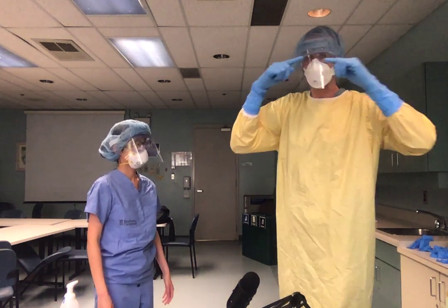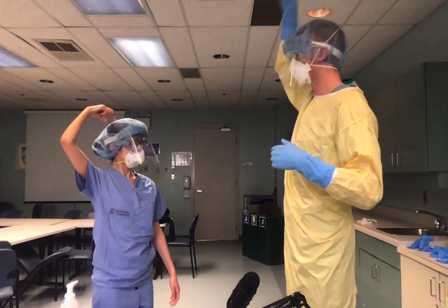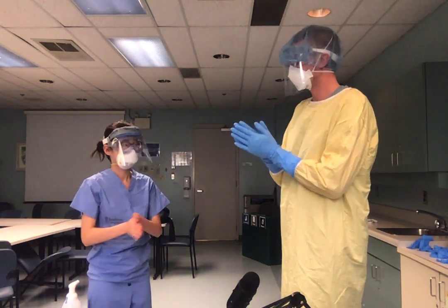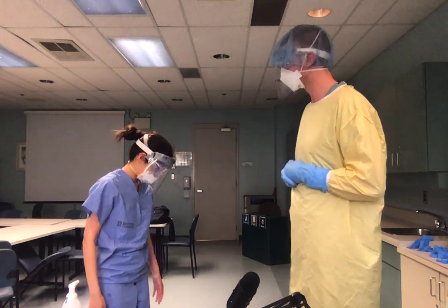Okay, and Nancy's put that bouffant on top of everything else. There's no straps over it. So she's just going to reach up and pluck that bouffant off, and you can let that fall into the disposal bin. Okay, we're going to wash the hands again. Just do this to signify you've done your 15 seconds and your 7-part COVID scrub.